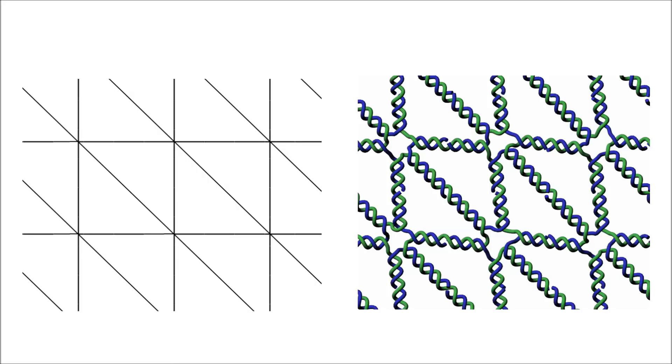In this mesh the staple strands are designed with the default staple generation in V-helix, where each staple strand connects two edges of the scaffold, placing a staple breakpoint in the center of every edge. This method works very well with meshes where the edges are roughly the same length. As I will show you, in meshes with a larger spread in edge length, this method may not be optimal.